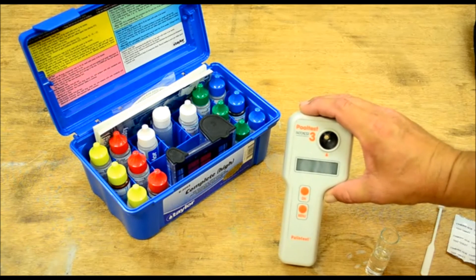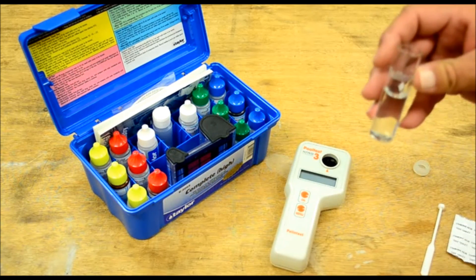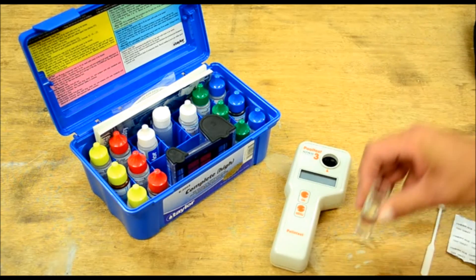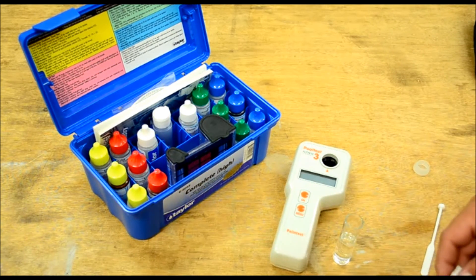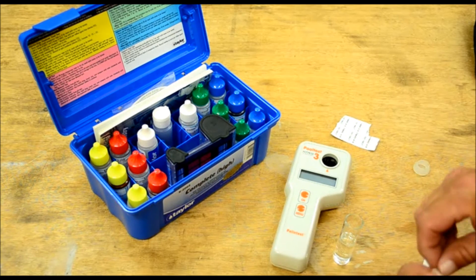We're back with the Palin test full test number three. I went ahead and filled up my test vial to the 10 milliliter mark — this is the cyanuric acid test tabs.